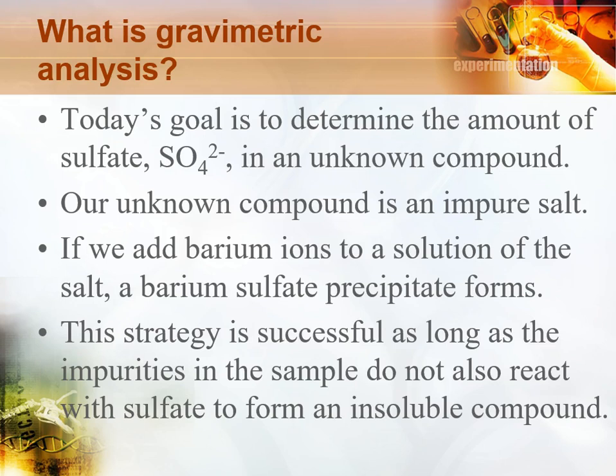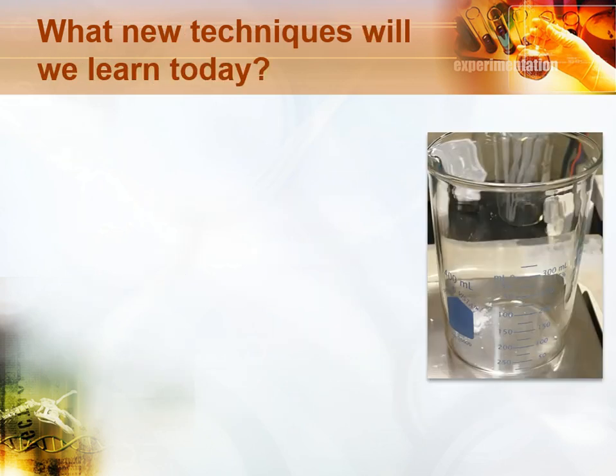We need to point out that this strategy is successful as long as the impurities in the sample don't also react with the sulfate to form an insoluble compound. And that is the case for the unknowns that we're going to provide to you.